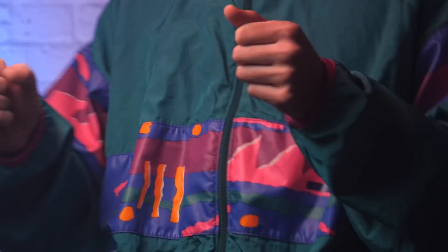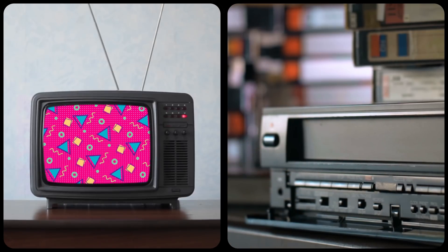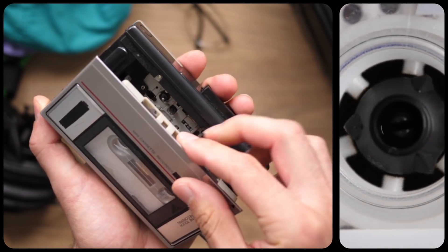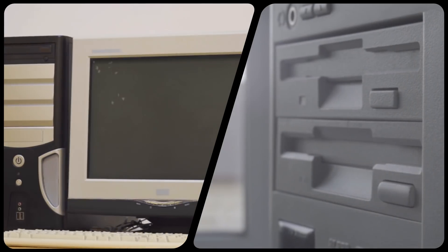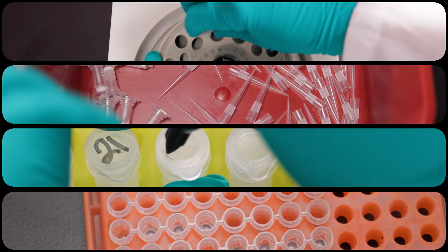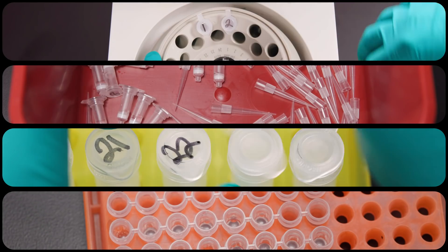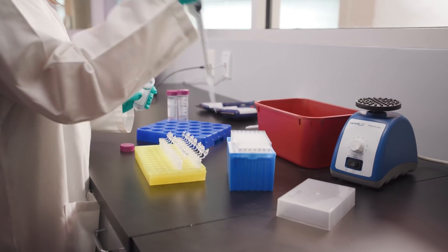Do you remember the 90s? This was how you watched a video. Listening to music meant you had to lug this bad boy around. This was your computer experience. And this was how you performed your PCR cleanup and plasmid prep. Look familiar? Yeah, we thought so.